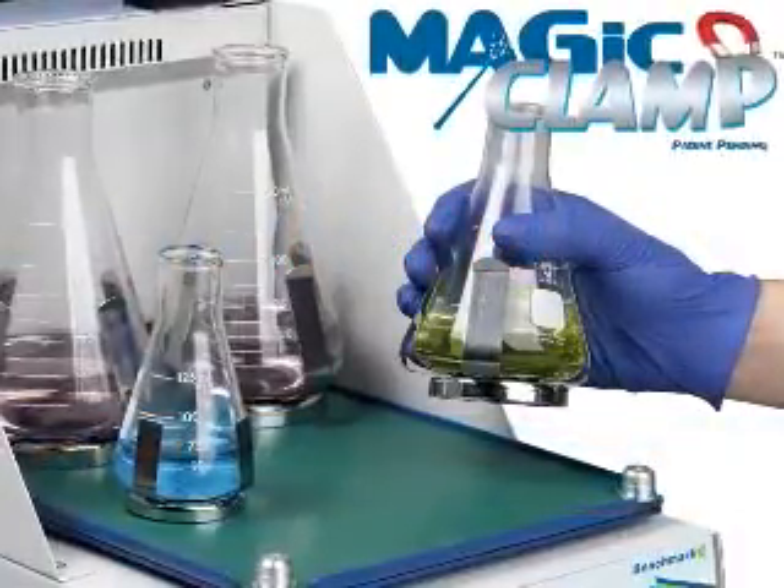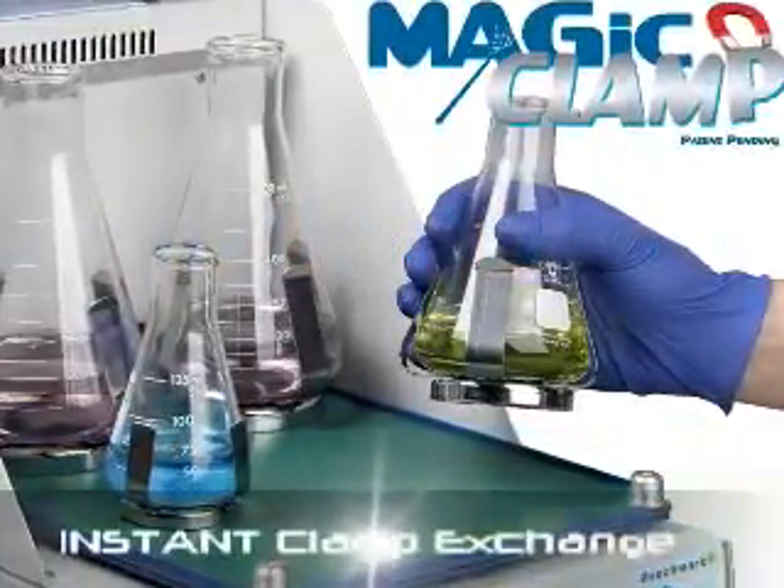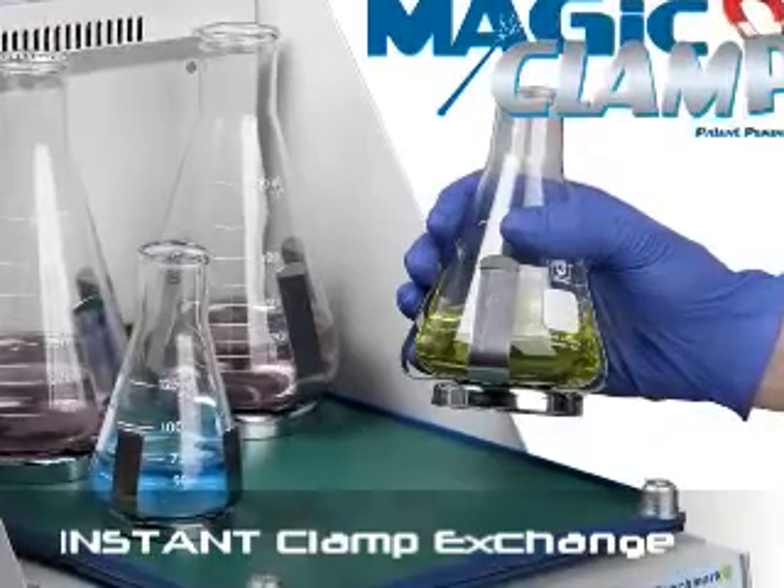Benchmark Scientific presents the Magic Clamp Universal Platform, the world's first instant flask attachment system.